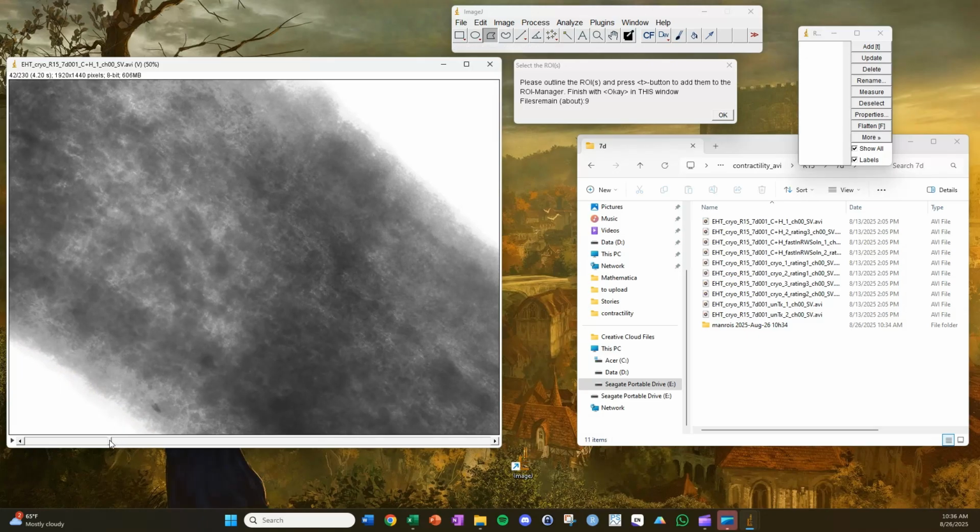So the upshot of that is that the way I have made the protocol is to always have my drawing of the region of interest be in a state where the tissue is taking up less area, namely contraction. So navigating to that there, I always choose the contraction from the first beating.